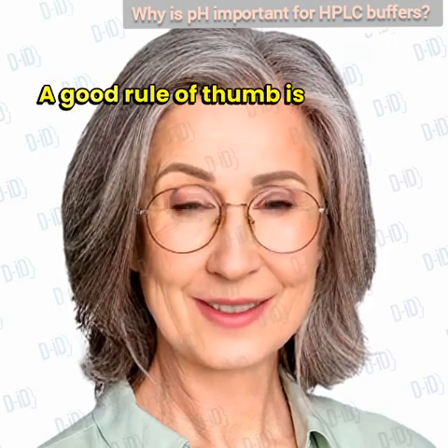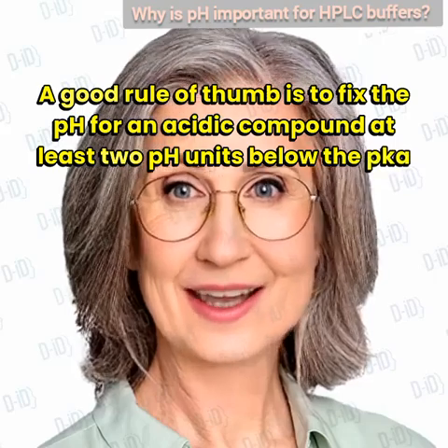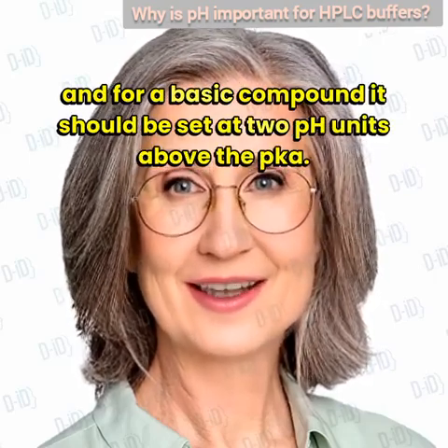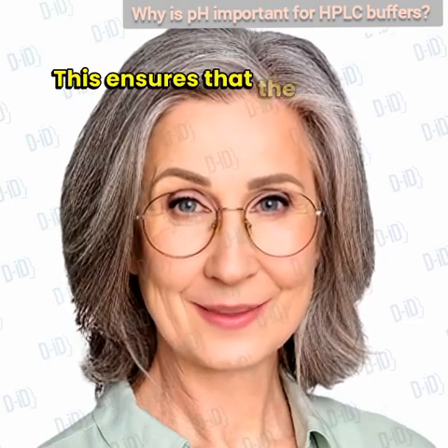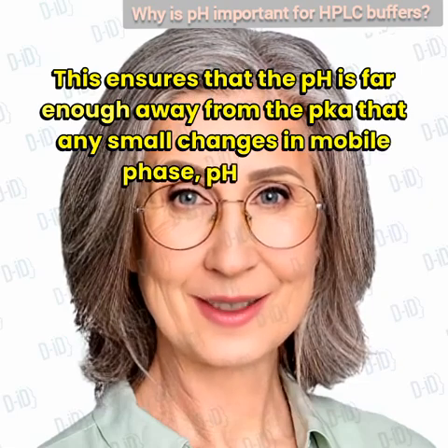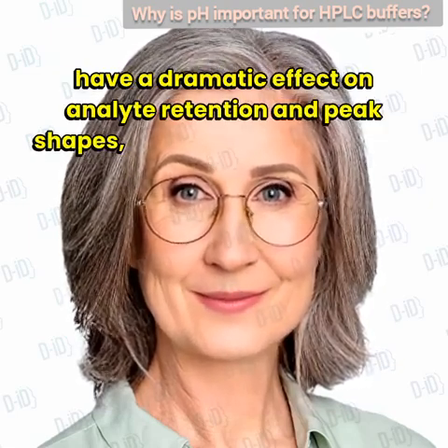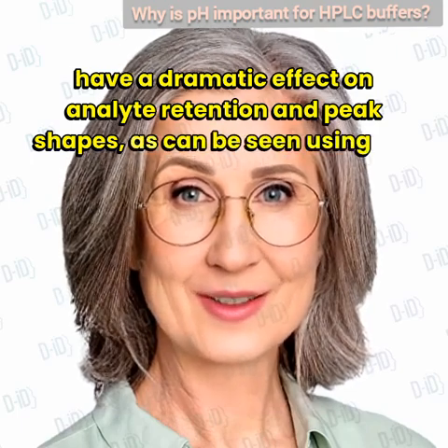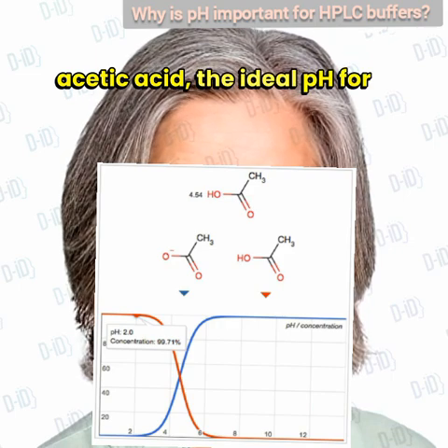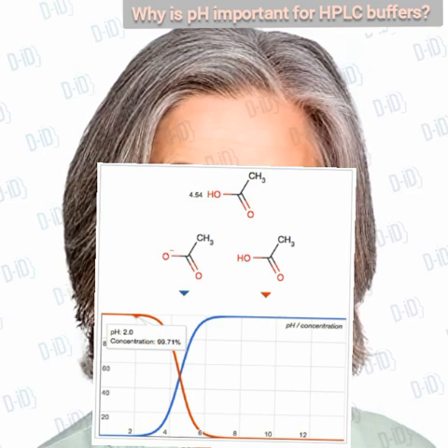A good rule of thumb is to fix the pH for an acidic compound at least 2 pH units below the pKa, and for a basic compound it should be set at 2 pH units above the pKa. This ensures that the pH is far enough away from the pKa that any small changes in mobile phase pH will not have a dramatic effect on analyte retention and peak shapes. As can be seen using the diagram showed for acetic acid, the ideal pH for a mobile phase sits within the plateau region for the neutral form of the analyte.